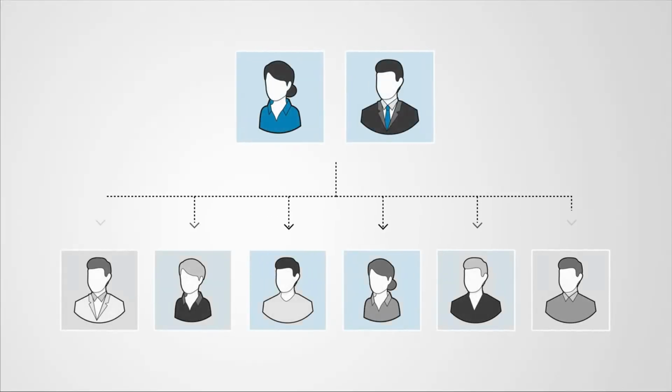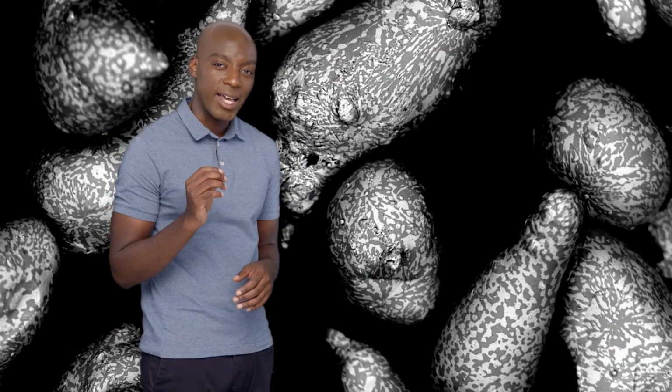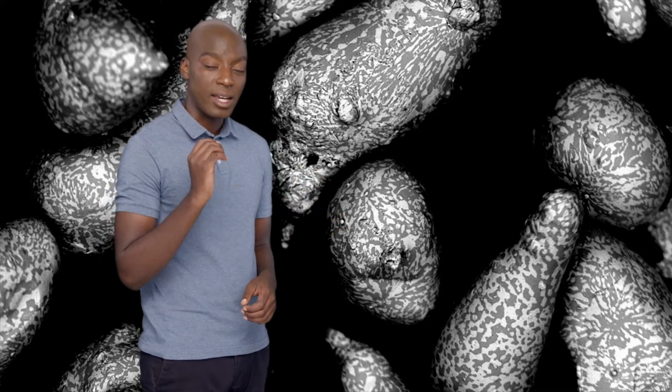Your experienced users need to train up new users and make sure all users can operate the microscope on their own. Some users may be specialized, doing the same task repeatedly. For them, it has to be easy to repeat the same workflow again and again. If your control software isn't powerful and easy to use, your experienced users lose time training new users, your workflows aren't properly controlled, your productivity goes down, costs go up. We'd like to show you a better way.